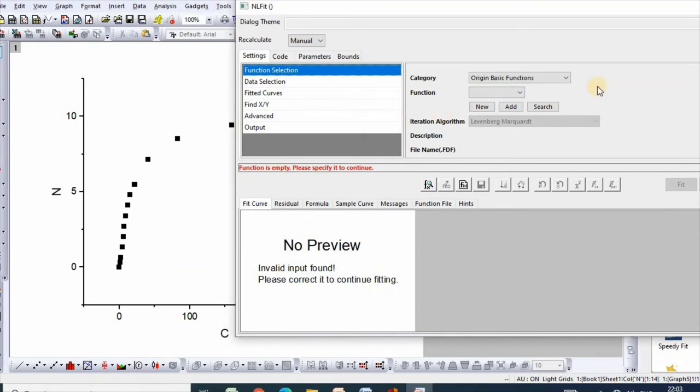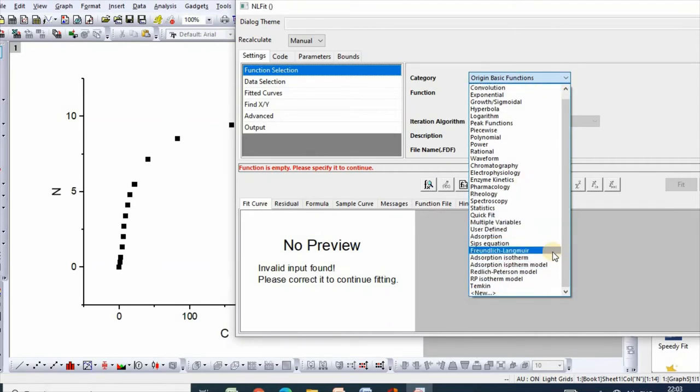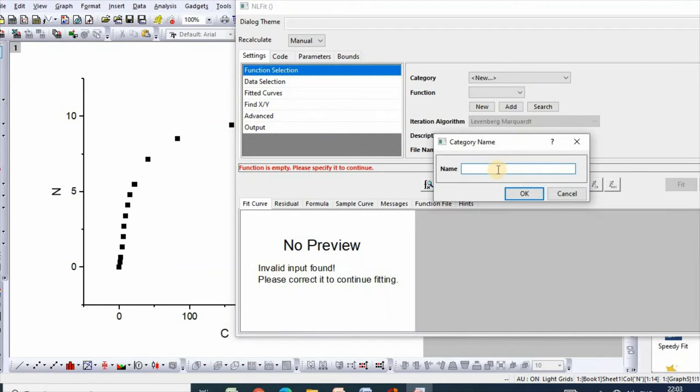Now you can select category as new and name it Temkin isotherm model.